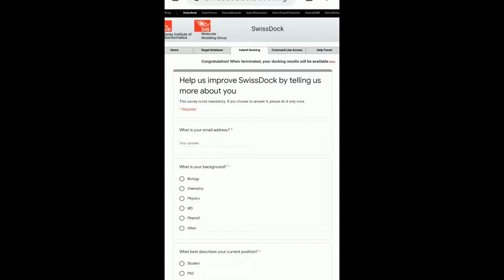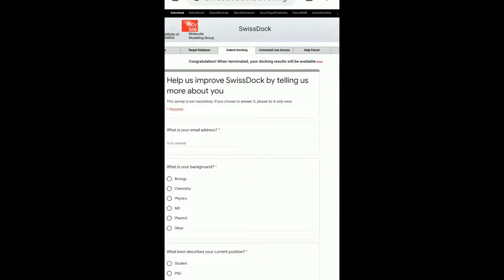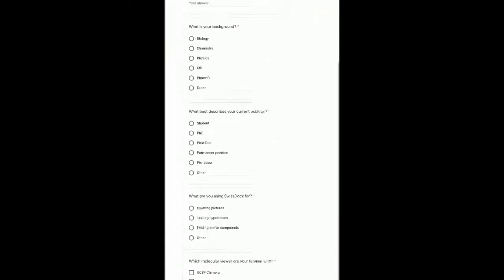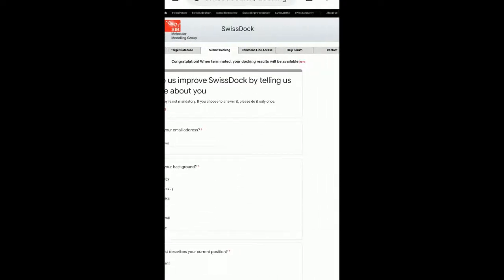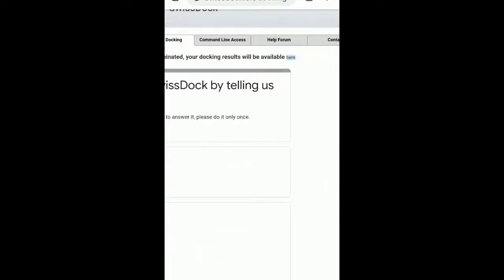Once it happens, it says 'Congratulations — when terminated, your docking results will be available.' What is shown below is just a form; you can ignore it completely. So if you click here, it says it is not yet terminated — it will be reloaded after your docking prediction becomes available.